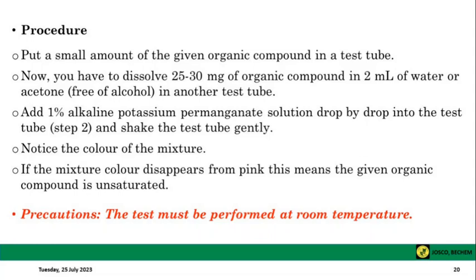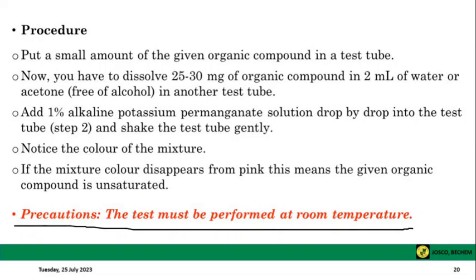If not, the color would remain the same. One thing you should note is that this test should be done at room temperature. As a chemist in the lab, you never forget to take precautionary measures.